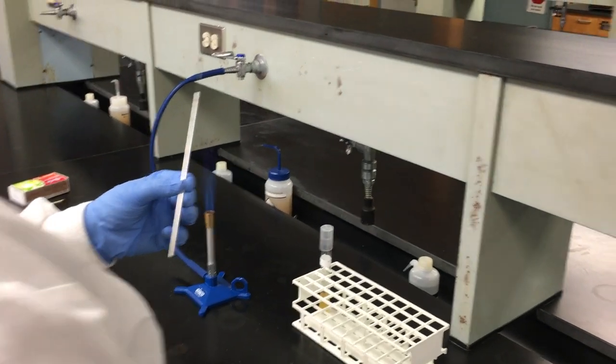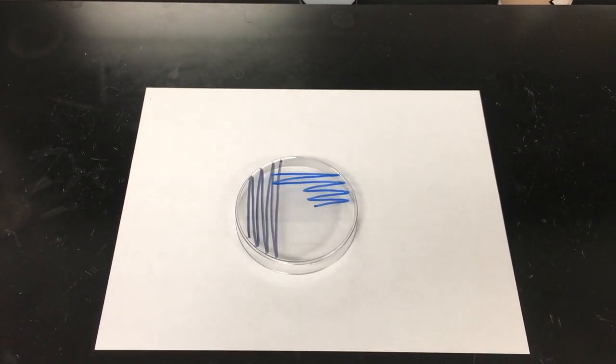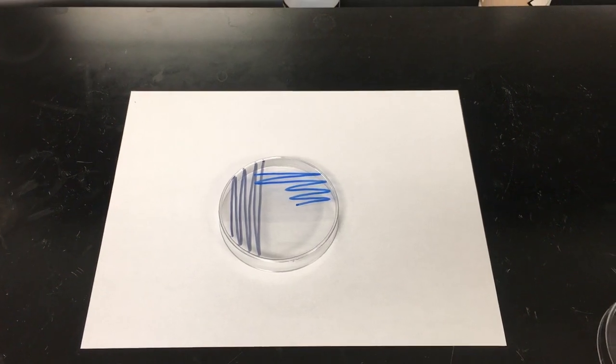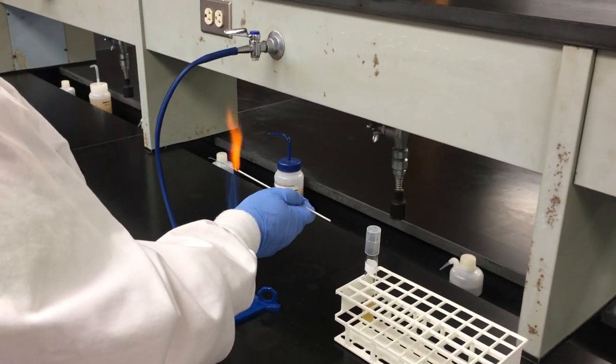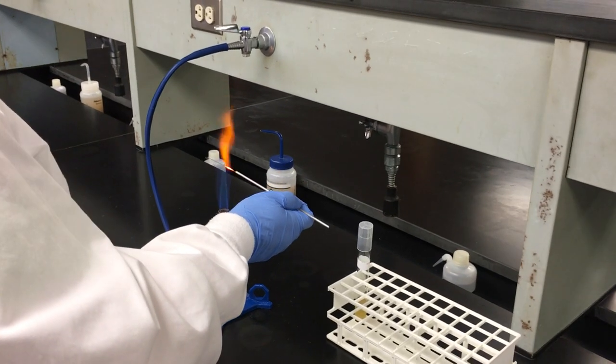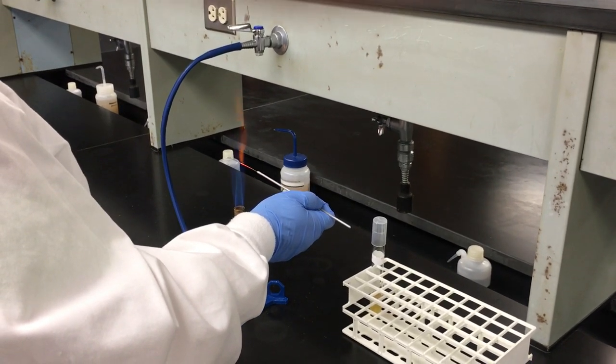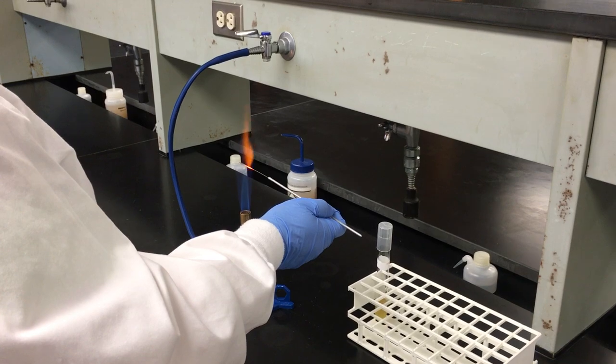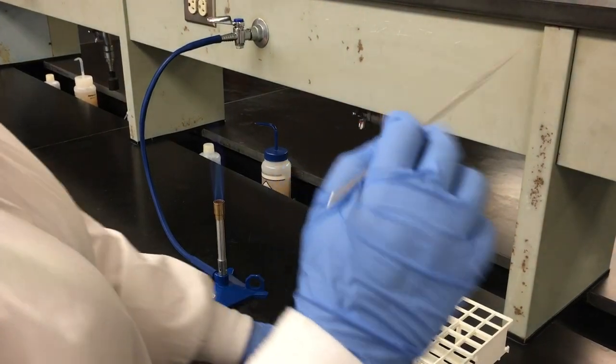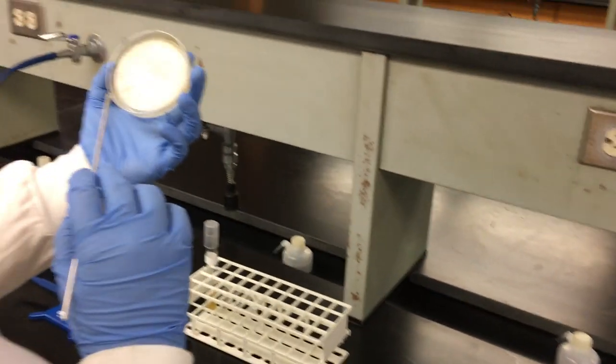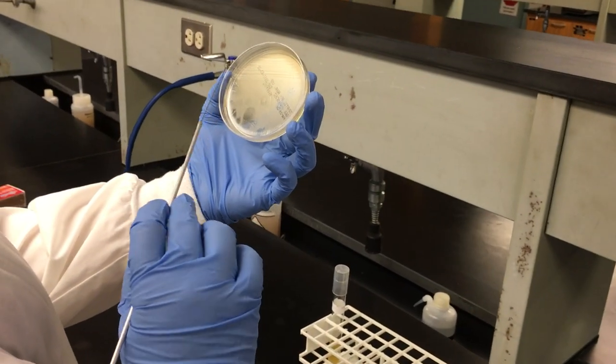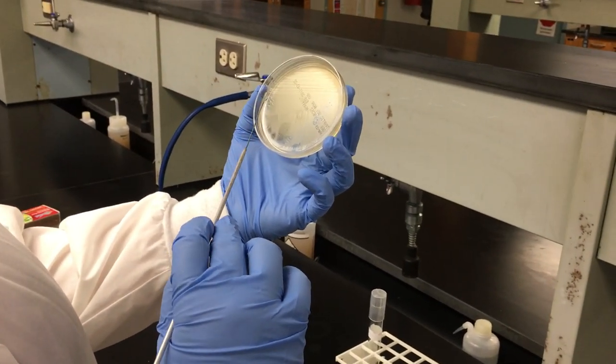You will then, once again, sterilize your loop, handle till tip, allow it to cool, go back to the same area that you originally cooled it in, back and forth until the sizzling sound is gone.